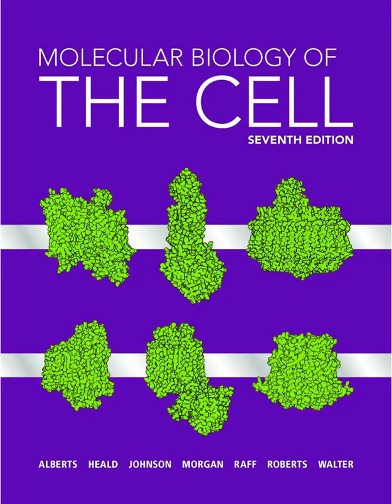Okay, but what about thicker samples, like a piece of tissue, not just cells in a dish? You can't just shine light through that easily, can you? No, you generally can't get high resolution through thick tissue. So that forces another approach, sectioning. Cutting it into thin slices. Very thin slices, usually 0.5 to 10 micrometers thick.